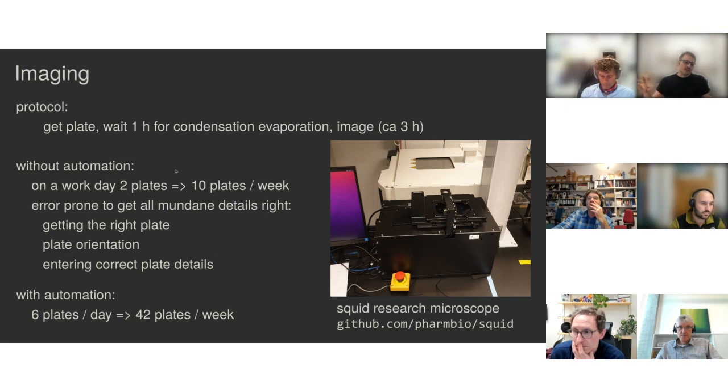So if you want to load the microscope manually with your hand, you can maybe do 2 plates on a work day, and that gives 10 plates per week. And then you always have to remember to do all of this with the microscope. And I've written down some things you can get wrong if you do this by hand.